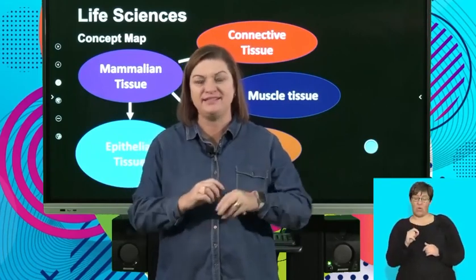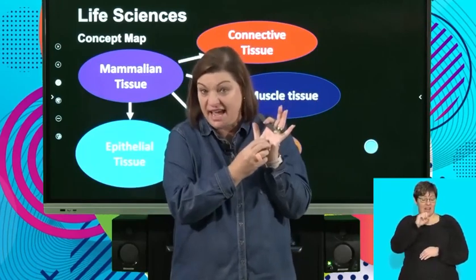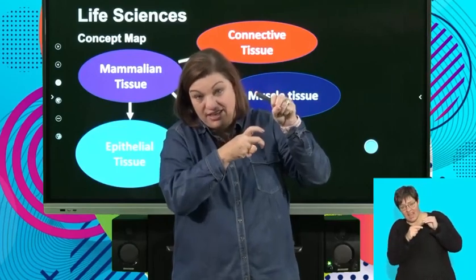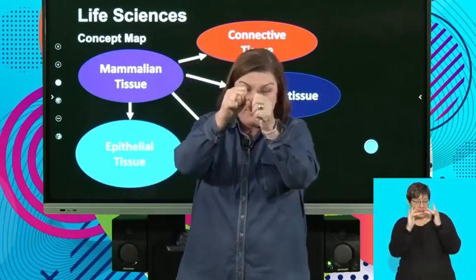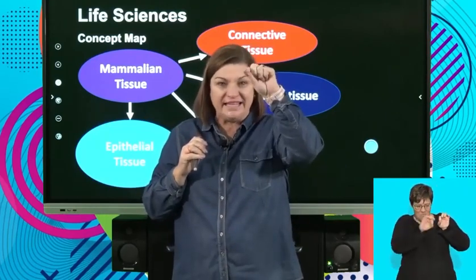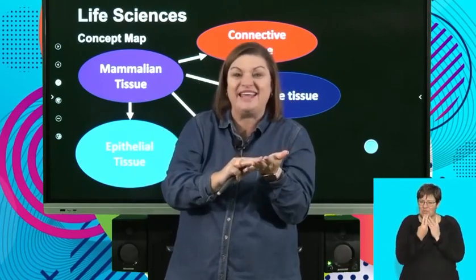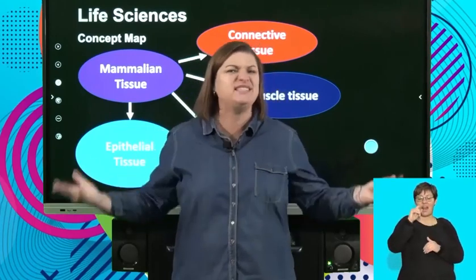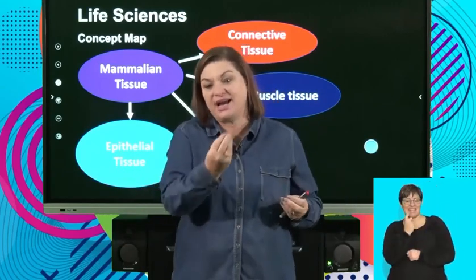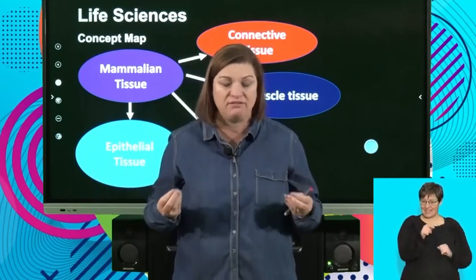Okay, so what we've done is, as I said to you, the skin, epithelial tissue, the fat underneath, the adipose tissue. When I lift up the fat, I've got that areolar connective tissue. And then when I break my leg bone, the wing, the two bones, sometimes I see a little white thing that is a ligament, and then I see that white, smooth layer that is hyaline cartilage. Then I can see the bone. The bone is going to be very obvious for me. And sometimes what I can see is like a red piece of string. That would actually be a blood vessel.